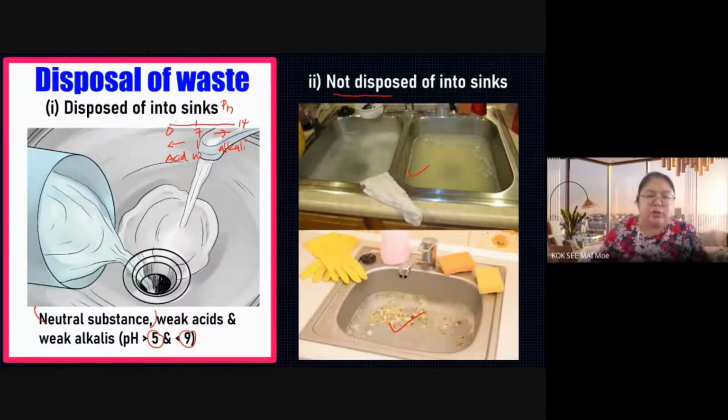This one, when you just throw it straightforwardly, okay, go in. All the liquid comes down, goes in. That's all. They're floating. Okay. Normally, big-sized objects, we cannot straightforwardly put inside the sink.